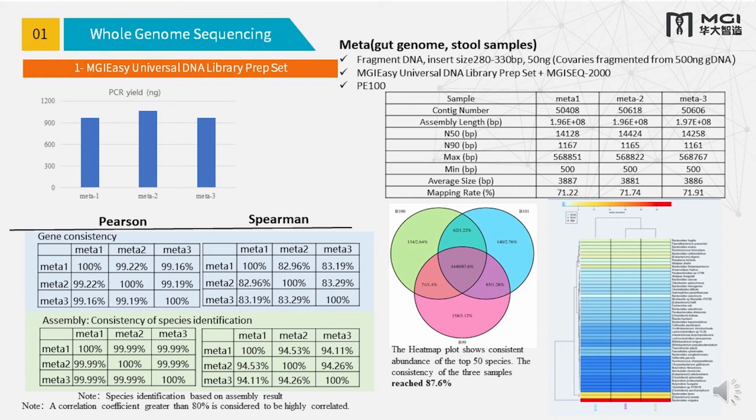So actually the meta de novo assembly for genome sequencing is now quite popular in China. Maybe in some publications they have already released some kind of algorithm to help the researchers do the de novo assembly with the optimal sequence. Why can they do it? Because for most of the bacterial variants, the genome is quite small, so they still have some way to do the assembly.